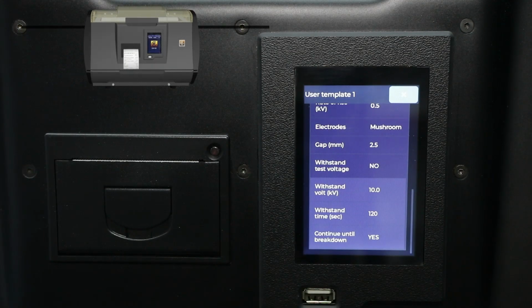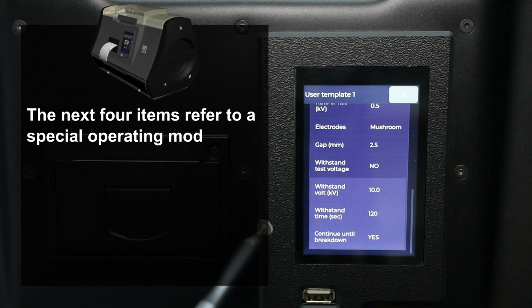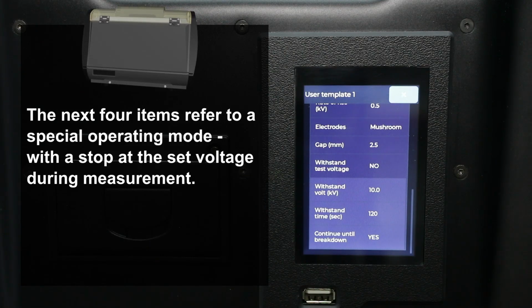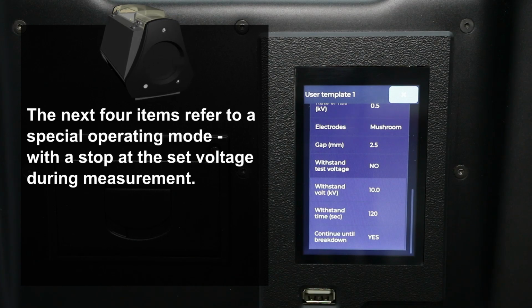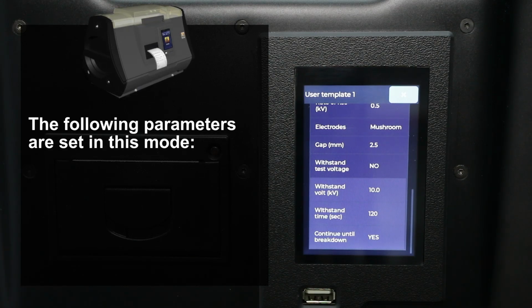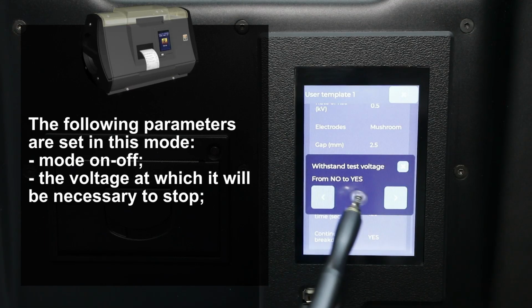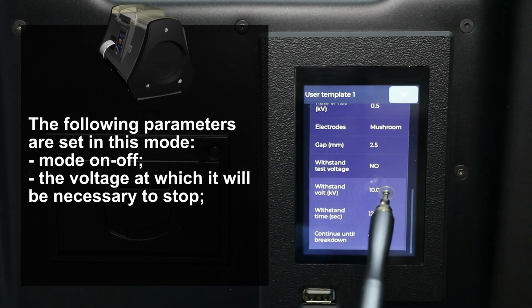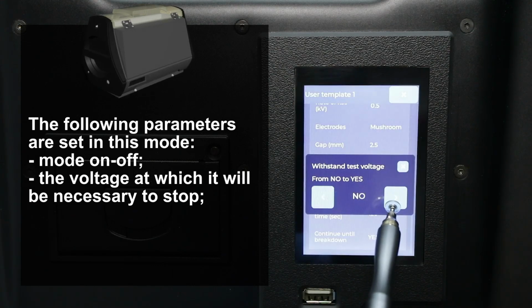The next 4 items refer to a special operating mode with a stop at the set voltage during measurement. The following parameters are set in this mode. Mode on-off. The voltage at which it will be necessary to stop.